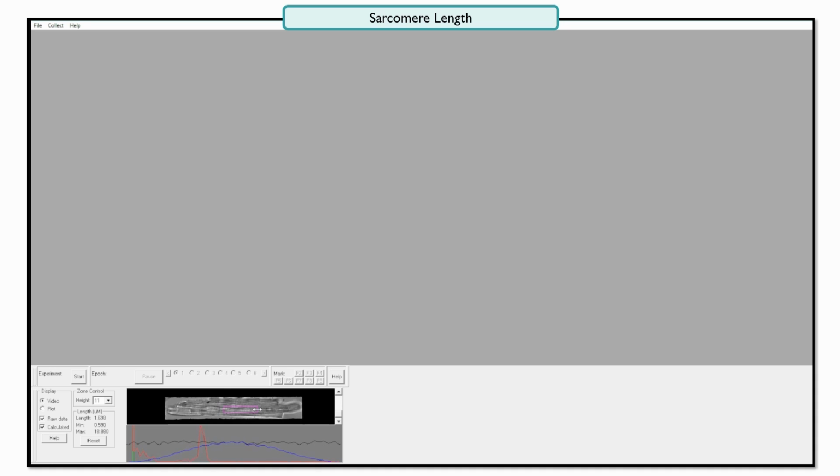Now, let's position our green lines. Sometimes, the right-hand side green line is pushed to the right edge. We can move it slightly towards the center. The left-hand side green line might be too far to the left as well, affecting the intensity of the red peak. Move it slightly closer to the red peak, ensuring it's not too close to it.